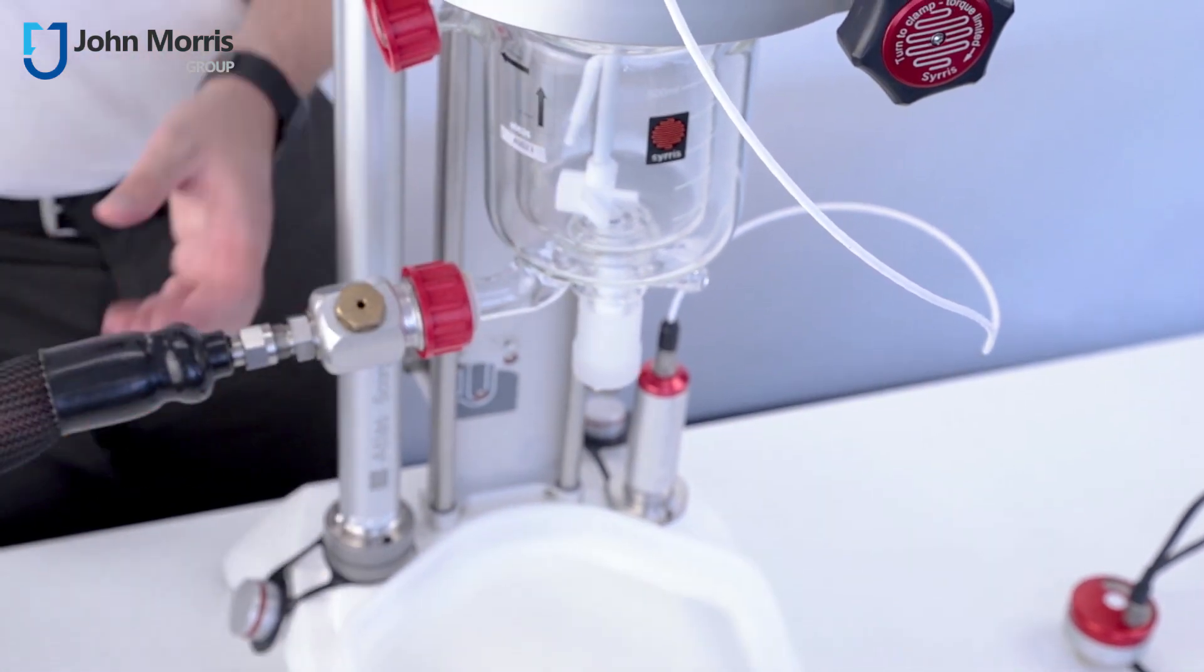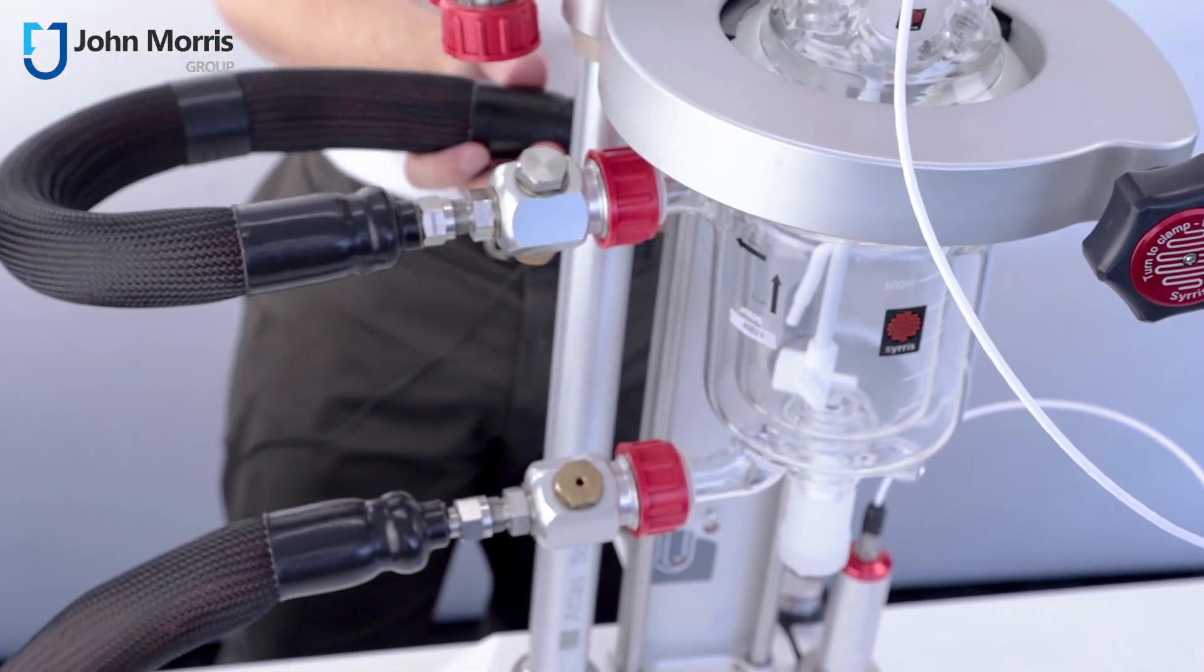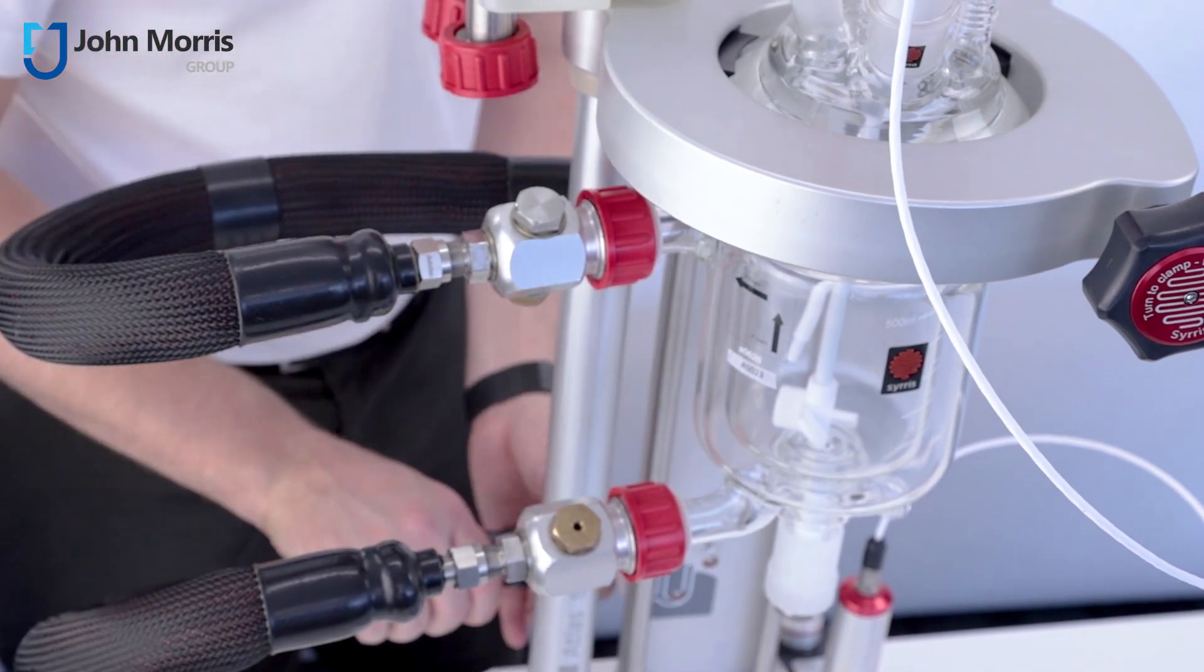You can have precise temperature control in the range from minus 90 up to plus 250 degrees Celsius using an external temperature controller such as a Julabo Presto series.